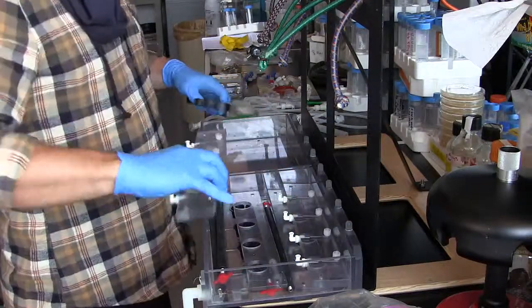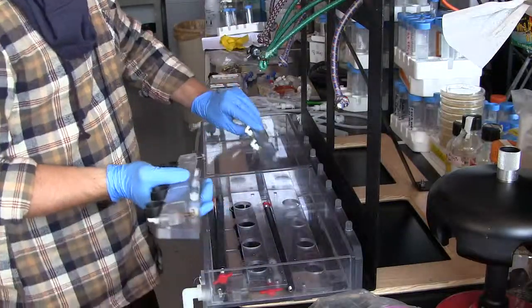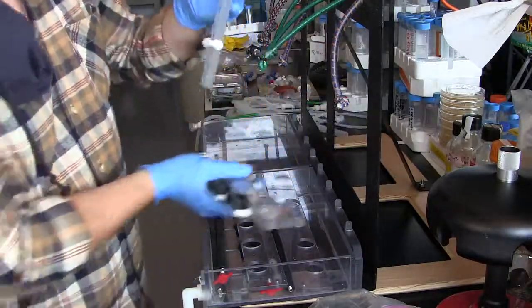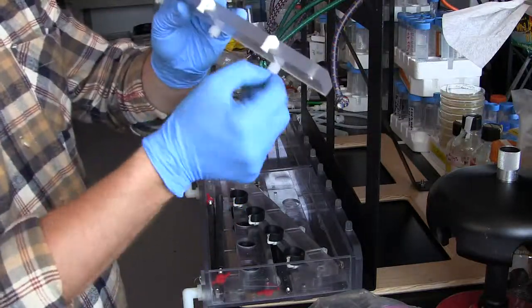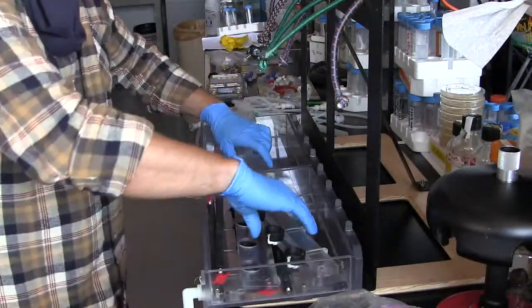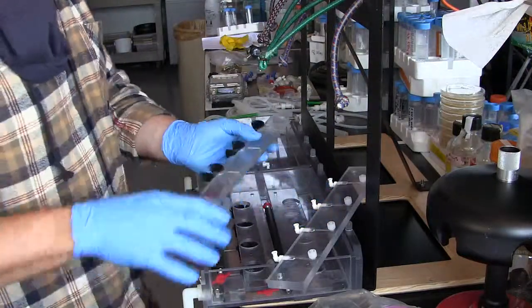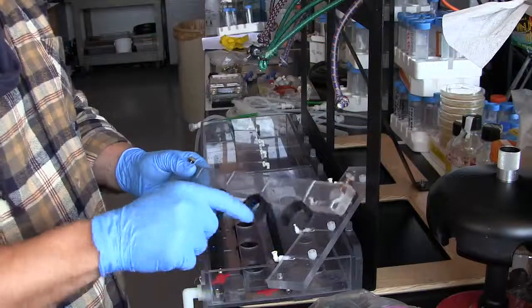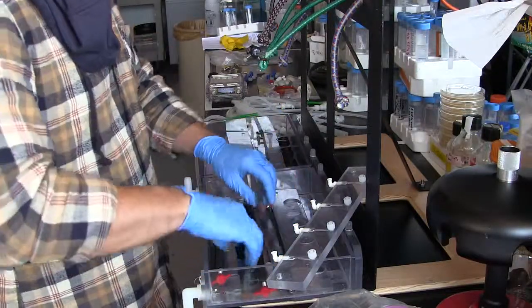Okay, now we have to divide the pieces up so that there goes one piece that looks like this, where you have an elbow followed by a luer locking outlet. One of those goes into each of these setups, so here's the other one for this one. Then we take the piece which has the sample holders here, you can put one of those in each. This one would be for here.